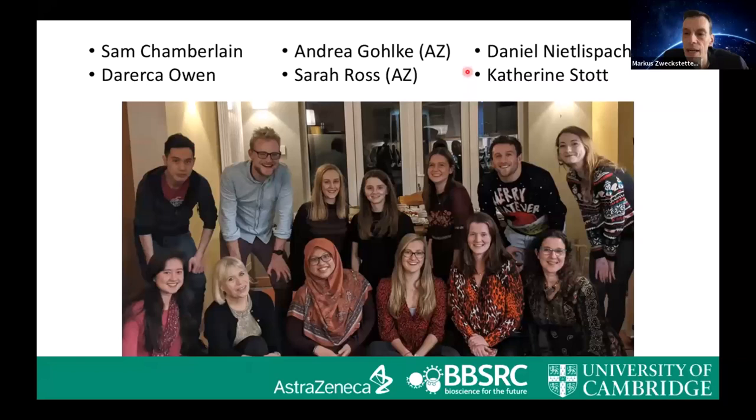Kevin Gardner says, hi, Helen. Quick question on RAL-A nanodisc docking. While I can imagine why there might be a preferential tilt angle, it looked like there were slightly preferential rotation angles too, given what I would have thought would be a homogeneous lipid environment around RAL-A. If this preference holds, what might be causing it?